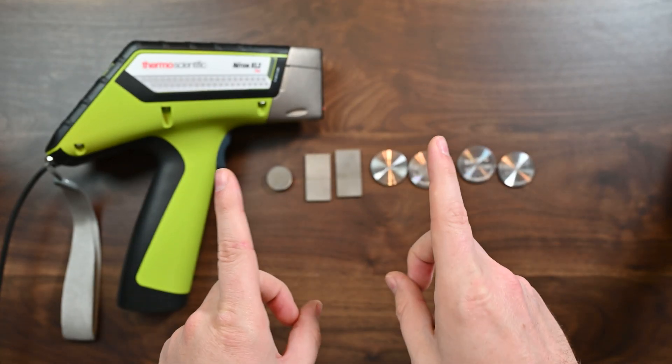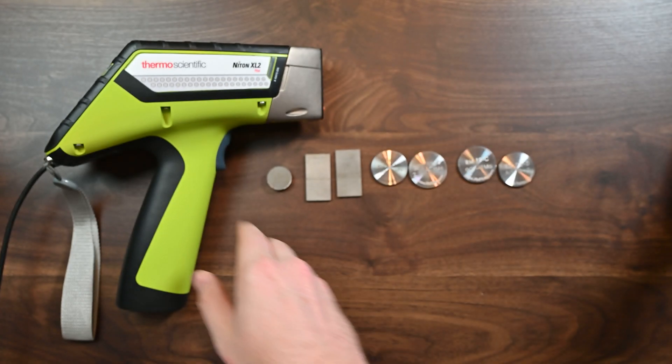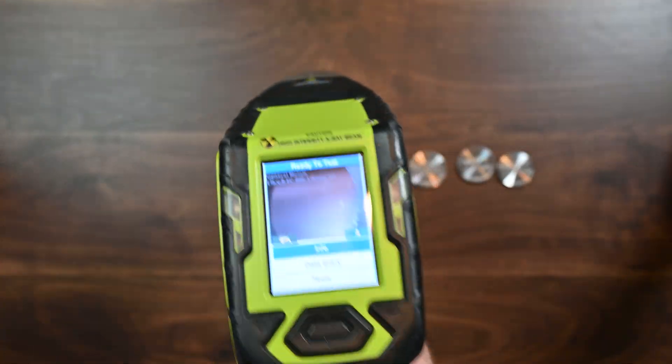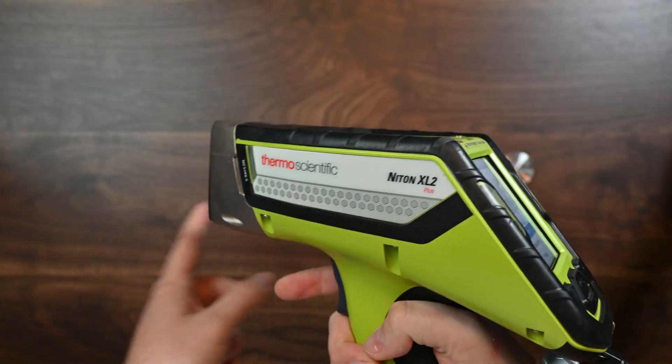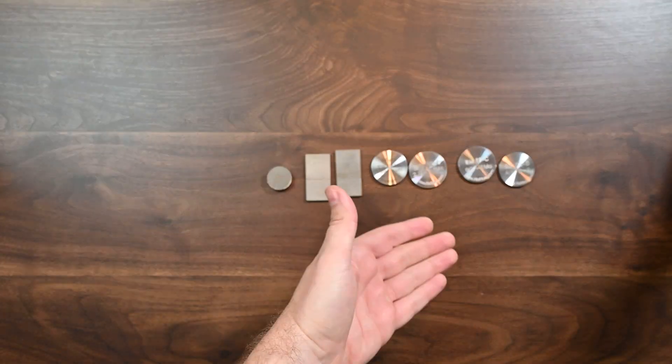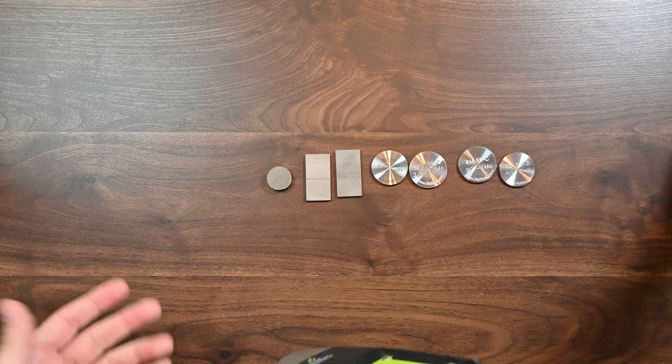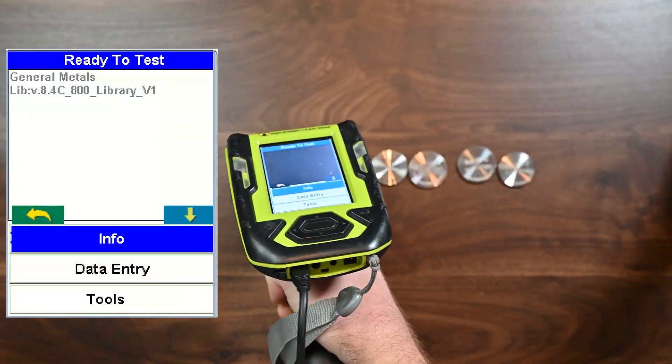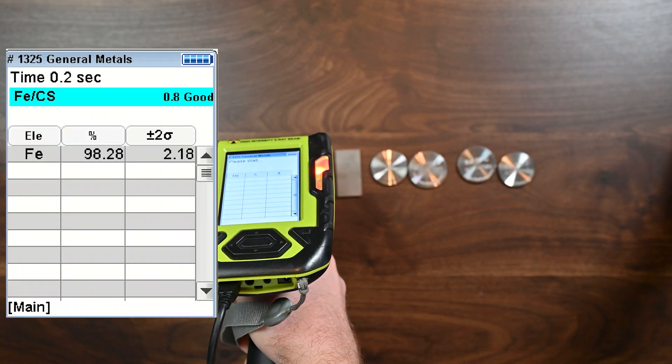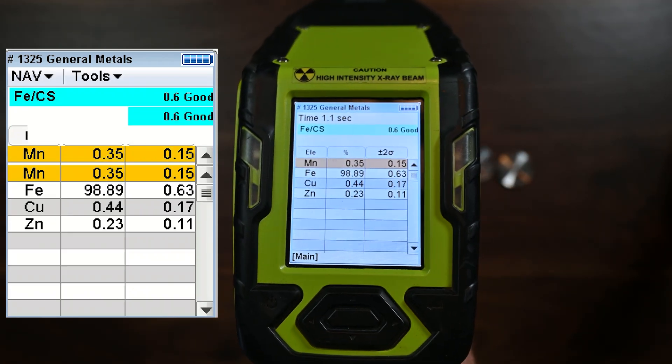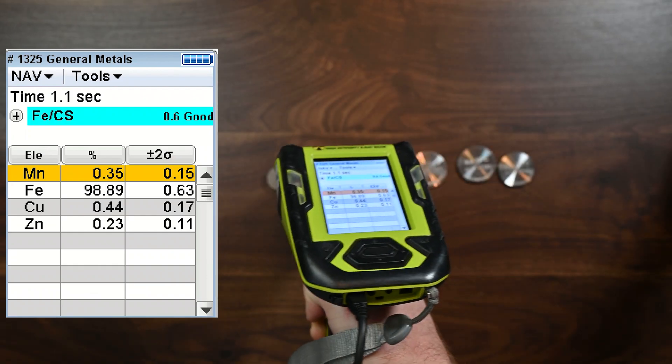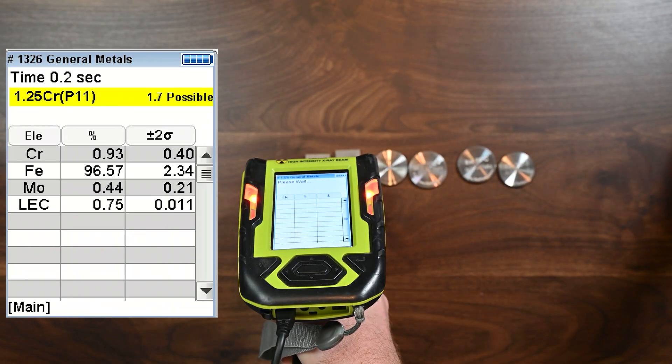We're going to start by doing a quick test of each one of these. I want to see how fast this analyzer, the Niton XL2 Plus, can test all of these materials down below and can it get the right answer. So the first thing we're going to do is test this steel sample. You're able to see that within one second, we're able to test that one.